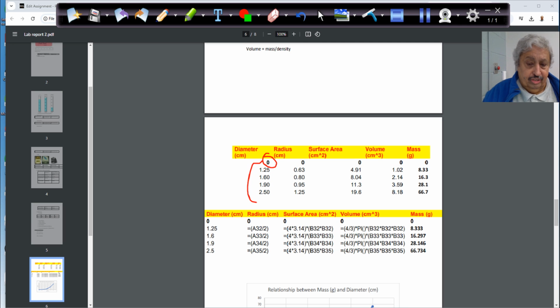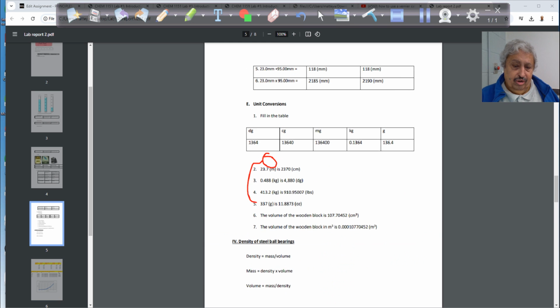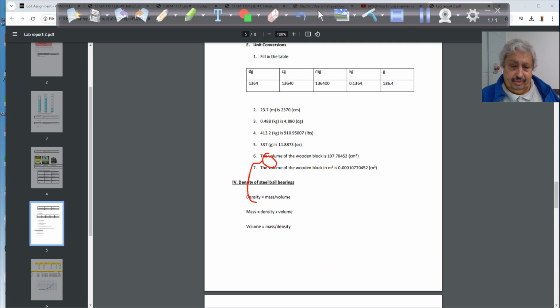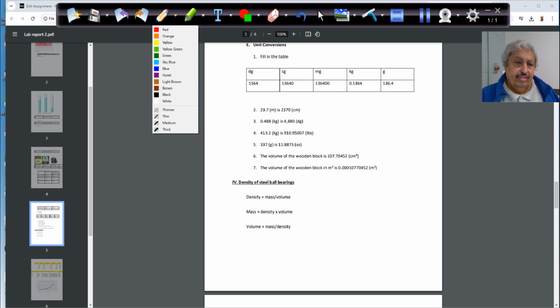So that's the diameter here, and then out of this one you can calculate the mass here, correct? I'll make a lab report for this tonight. You'll like it. The way I'll put it is very nice. So what's the relationship? You do all this together to determine the radius by measurement and the weight by measurement.